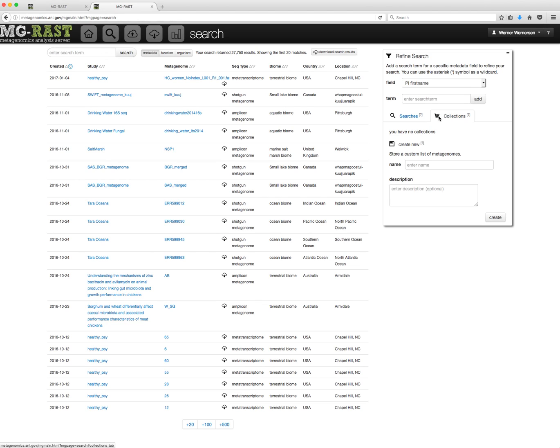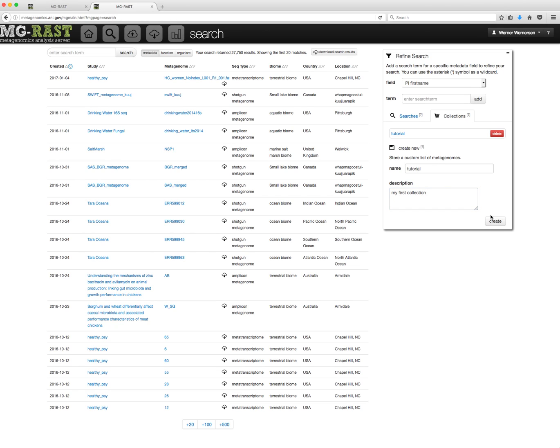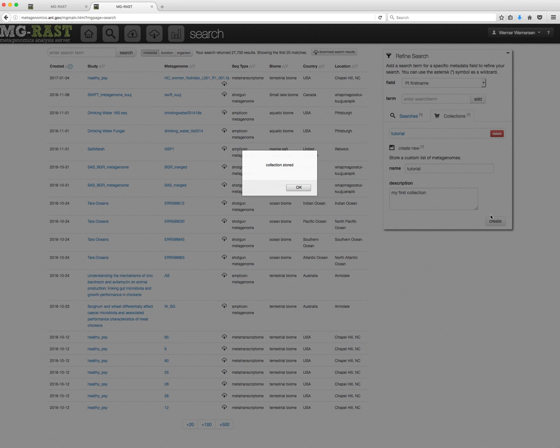To create a new collection, you have to choose a name and enter an optional description. Then click the Create button. A message will pop up indicating that the collection has been created.